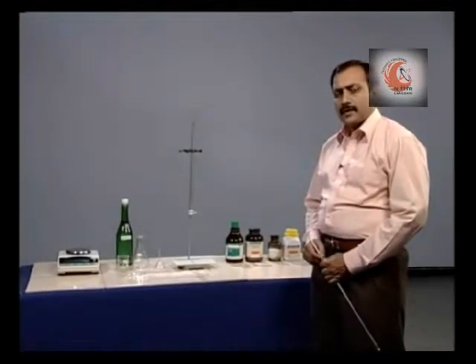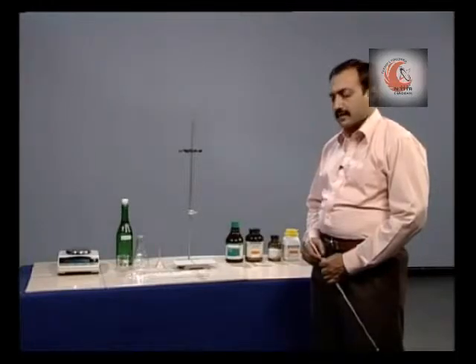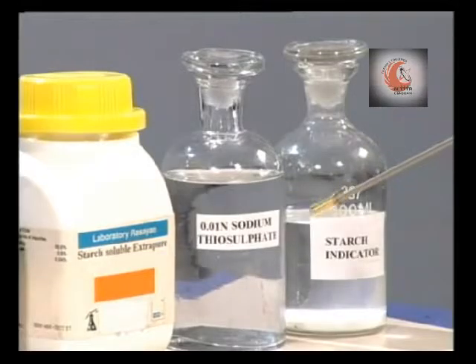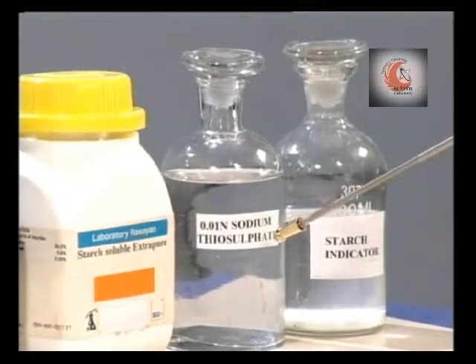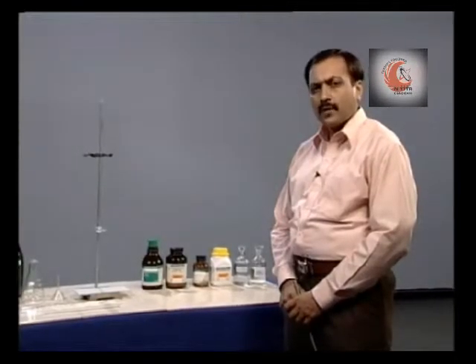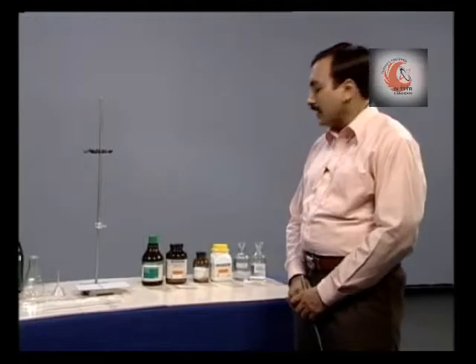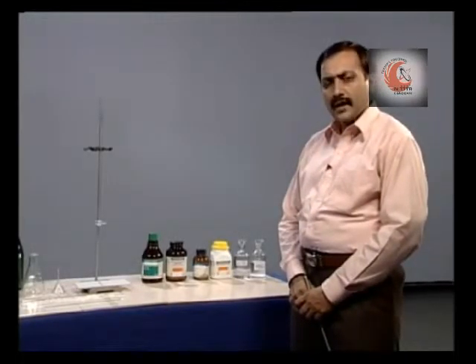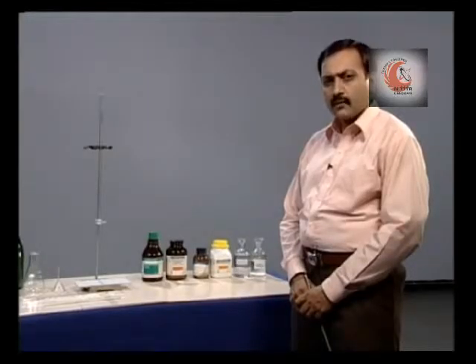First, we prepare the reagent solutions. Sodium thiosulfate solution of concentration 0.01 N is prepared by dissolving 2.482 gram of the material in 1 liter of deionized or double distilled water.